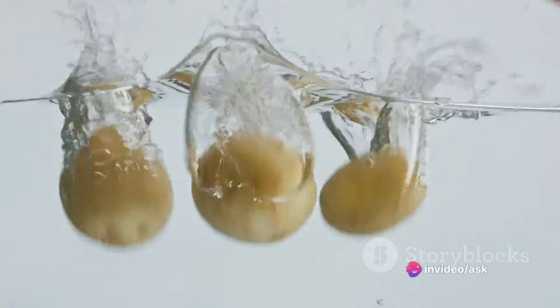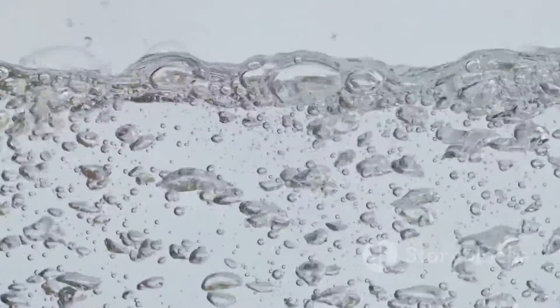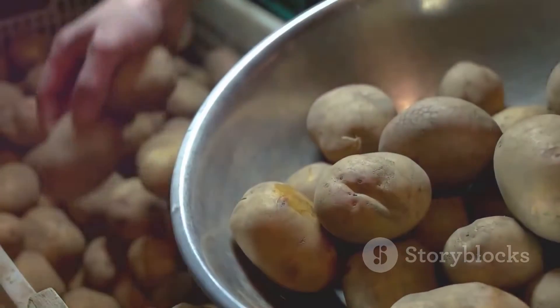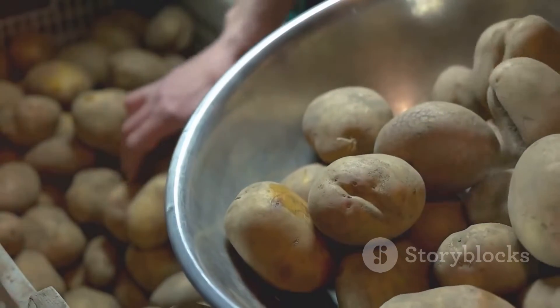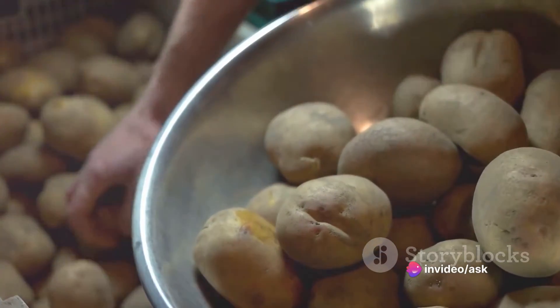On the other hand, the cylinders in beaker B, which was filled with sugar solution, decreased in length. This occurred because water molecules inside the potato cells moved into the sugar solution, where they were less concentrated. As a result, the cylinders lost water, became soft, and shrank.